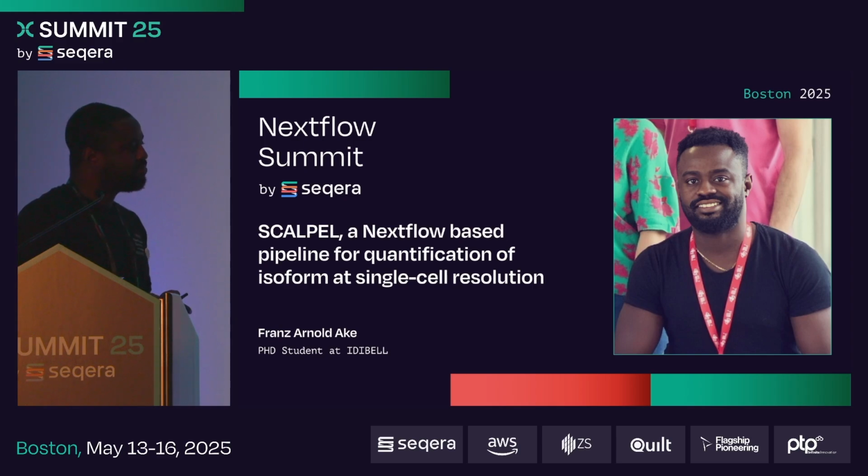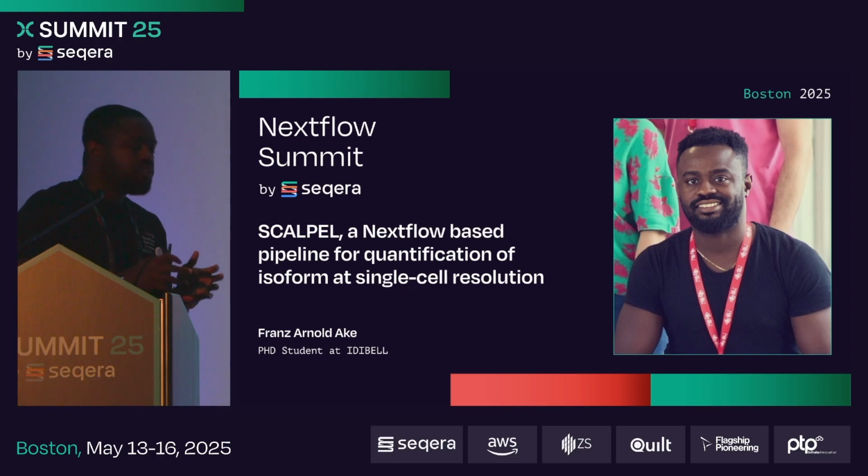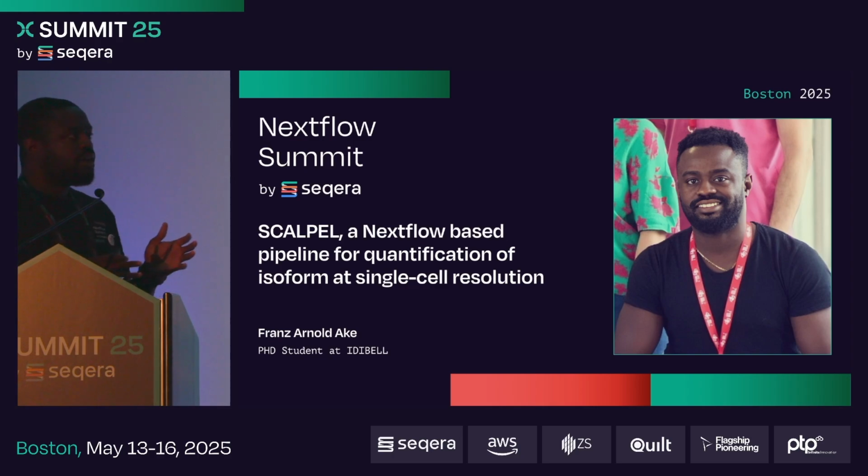One more. This is generating a lot of discussion. Harshal is asking, how would the analysis and results look different in disease states like cancer, where you inherently have copy number variations, large structural mutations, and possibly unknown isoform annotations? In the scientific literature, we know that alternative polyadenylation regulation has been associated with cancer. For example, in some cancers with proliferative tumorous cells, those cells tend to switch to a usage of the short isoform compared to the long isoform. So it's something which has been published before.